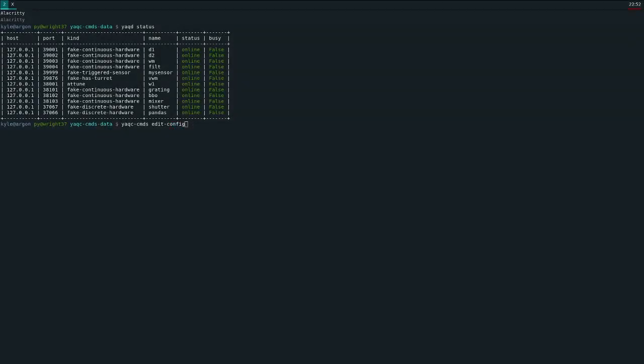Welcome to the introduction to yaqc-cmds. Yaqc-cmds is a client within the YAQ ecosystem, primarily targeted towards applications in coherent multidimensional spectroscopy, or CMDS.